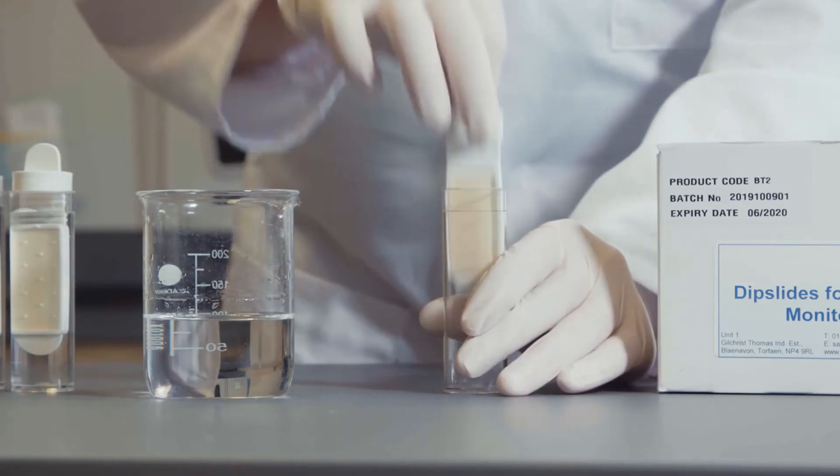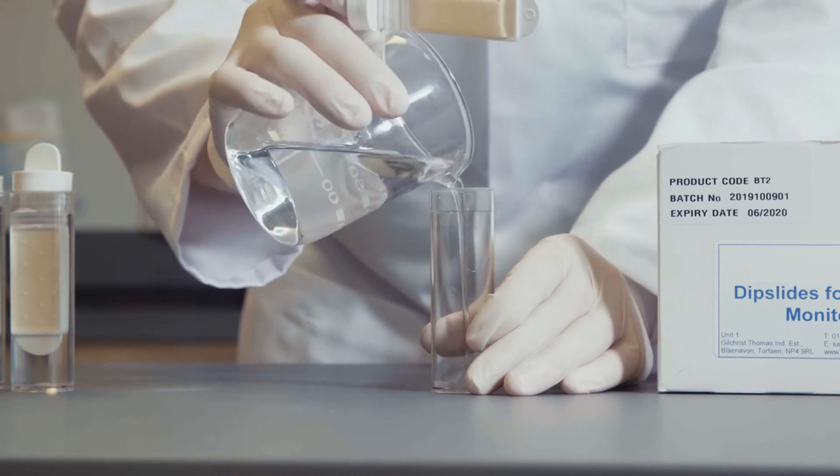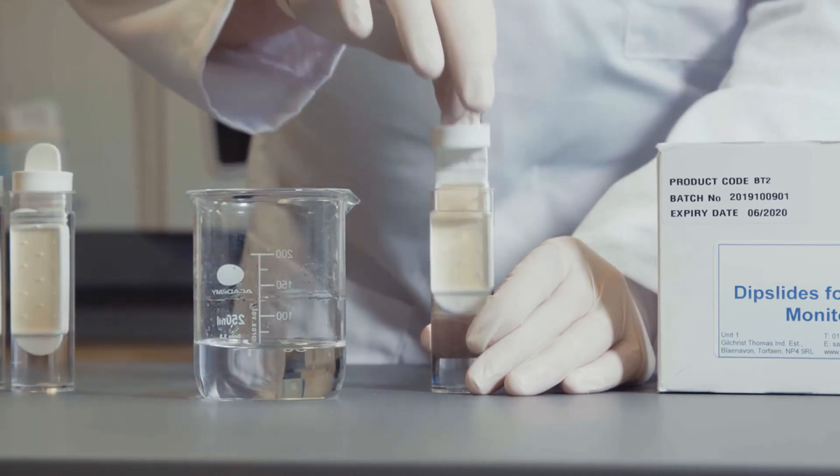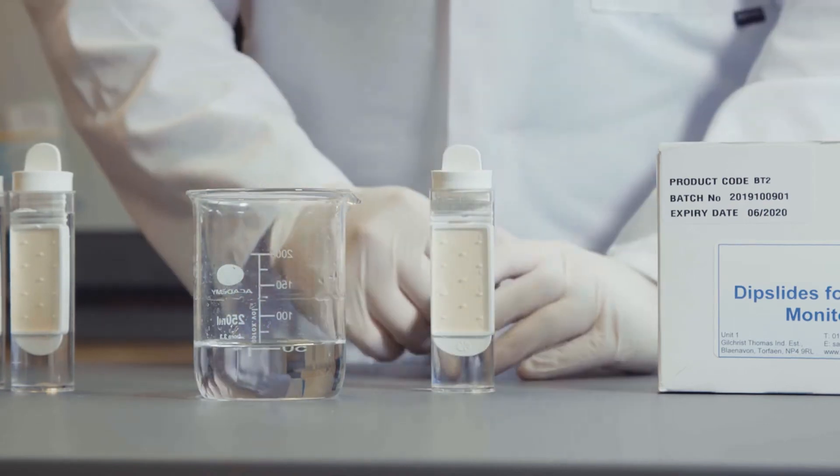Remove the agar paddle from the protective tube. Ensure the agar does not touch anything. Carefully fill the tube with test sample and immerse the dip slide directly into the test sample.